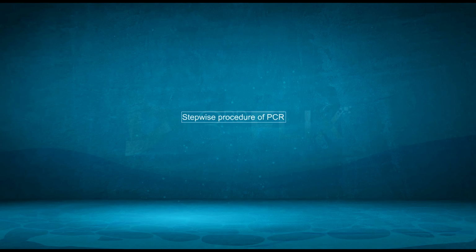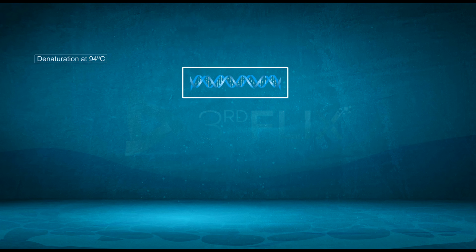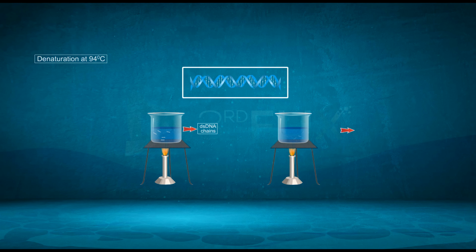Stepwise procedure of PCR. Denaturation at 94 degrees Celsius. Double-stranded DNA is subjected to denaturation by breaking up of hydrogen bonds. Short chains of single-stranded DNA are formed.